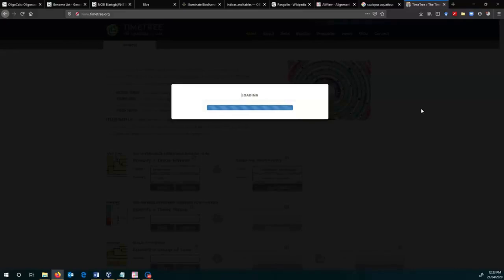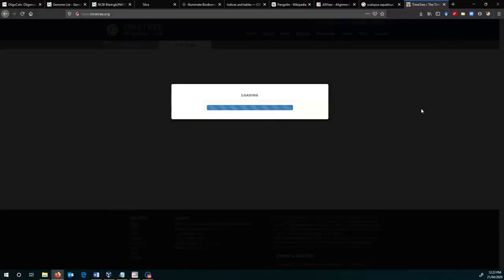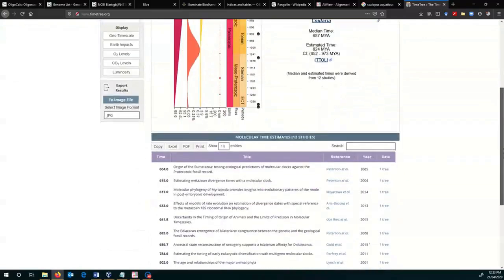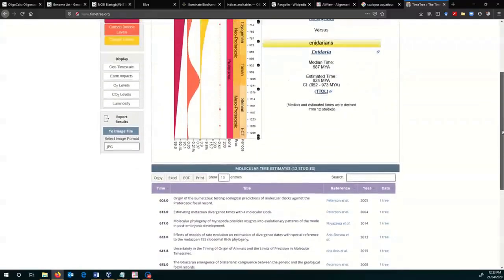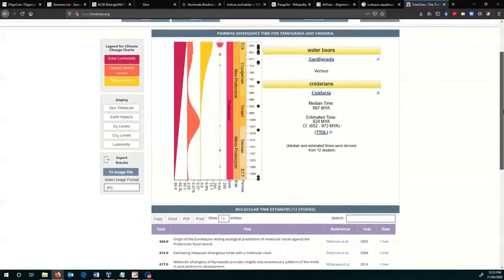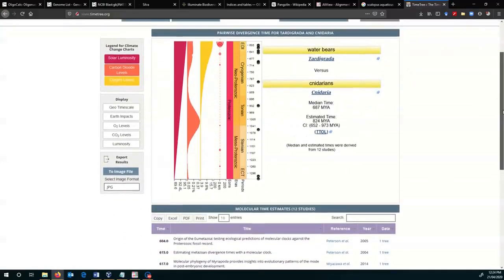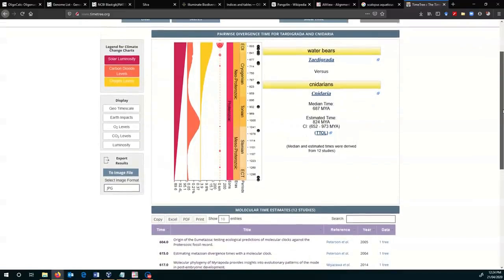And once you've done this a few times, of course, you get a bit of an idea of which gene regions would be useful for that. As a general rule, mitochondrial genomes will be useful for interspecies things, inter-family, class, phylum things. Then you would probably use nuclear 18S or 28S.